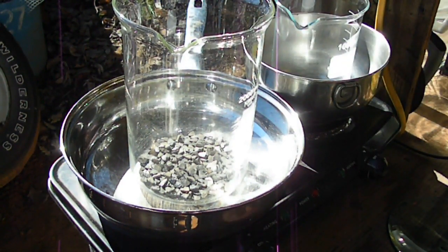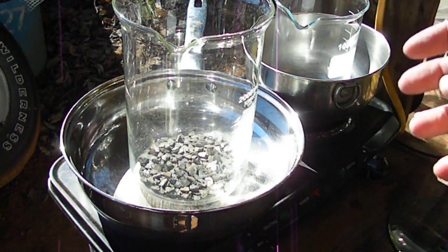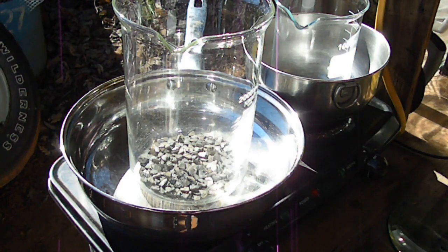I've got enough acid out. Generally with silver you're looking at about 1.5 mils of nitric per gram of silver. I've got enough acid out in my beakers over here to do that, but it actually should take less because these are tungsten, so there's going to be a lot of metal remaining. It's more like a really heavy plating on them, or I hope it is. Anyway, we'll see. It should take a little bit less, but I have enough to totally dissolve them if it was the total weight, already out in my little plastic beakers that I like to pour my acid out of.